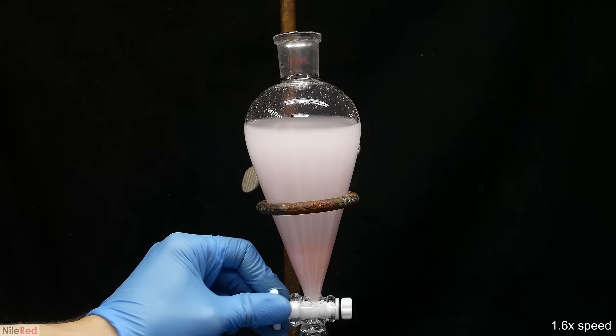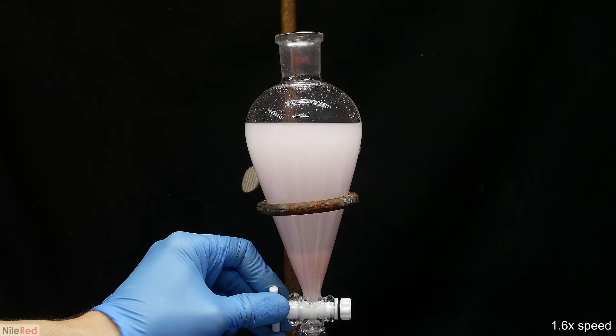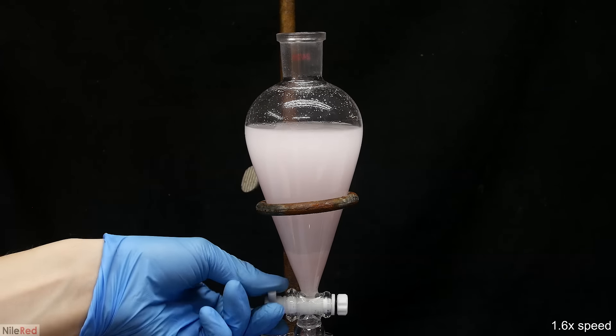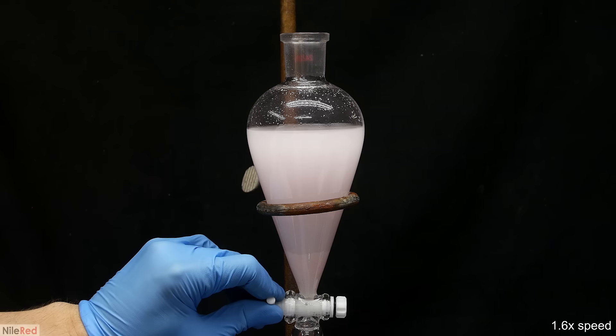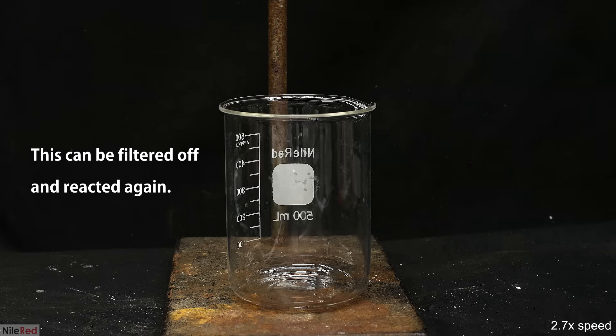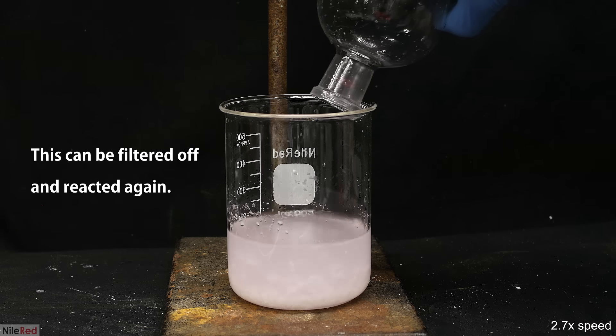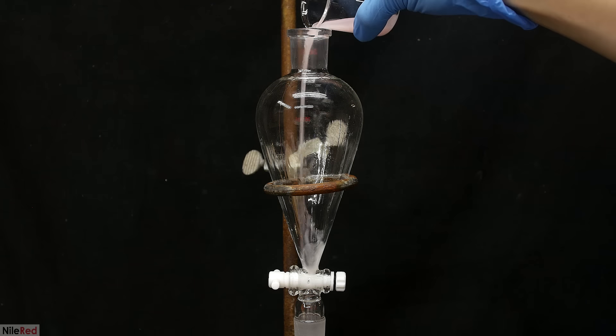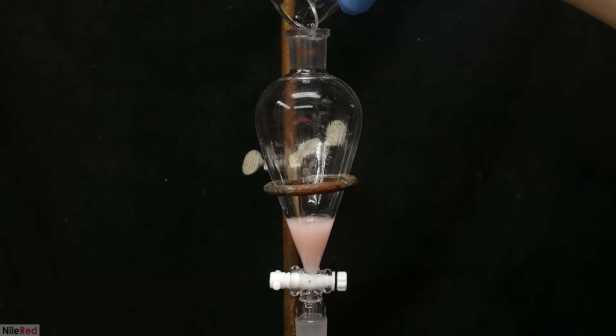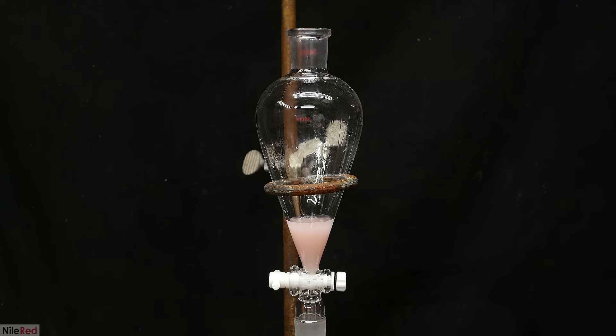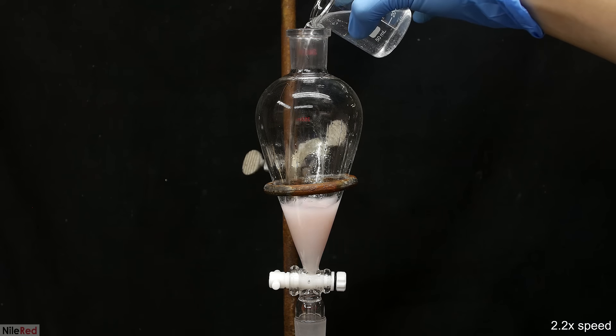I come back about 20 minutes later, and it's kind of hard to see here, but there is a lower layer that has formed. So this lower portion is drained into a small beaker, and the rest is dumped off as waste. The separatory funnel is washed, and the crude wintergreen is re-added.